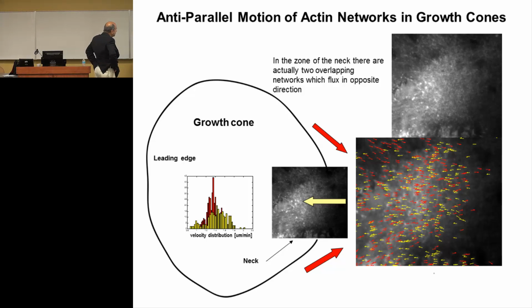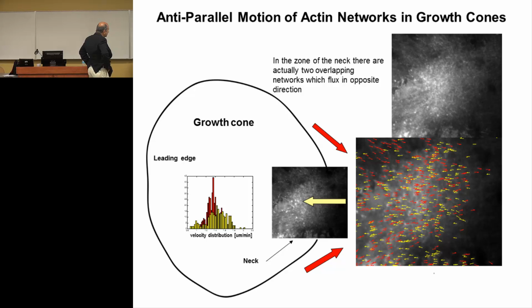This initially was thought of as a zone where nothing happens. Just there is a network coming in. So this here is narrow. So you have a large side and a narrow one. And so they thought here everything stops. And the idea is that if you see the yellow vectors that go up, they have a faster distribution but high variation, which makes sense because you go from narrow to wider. Opposite, these that go inside are slower and also very narrow.